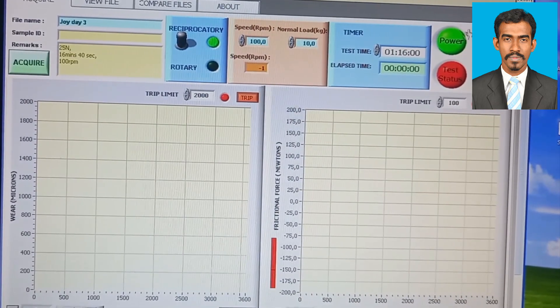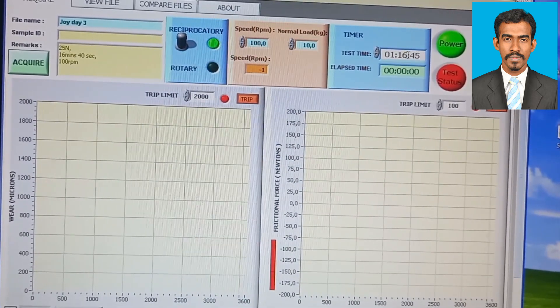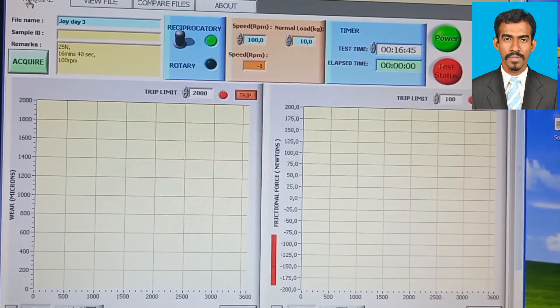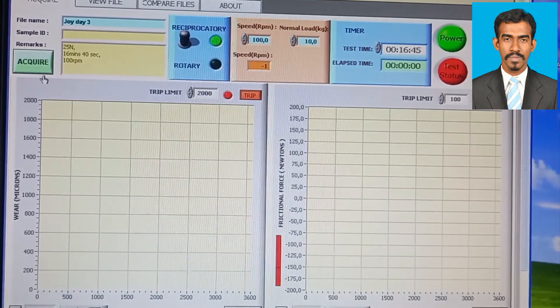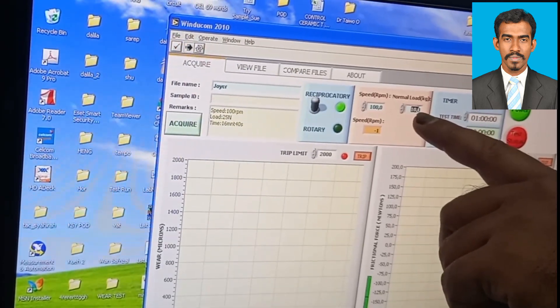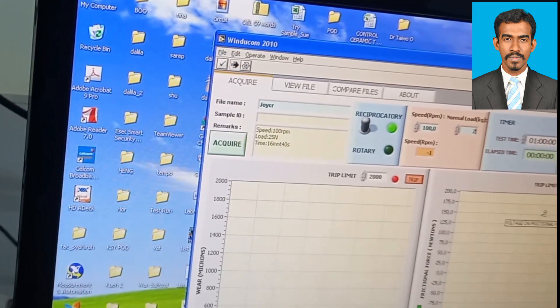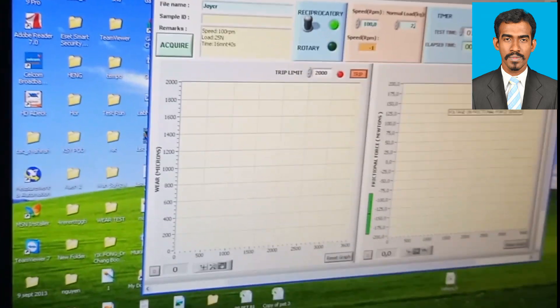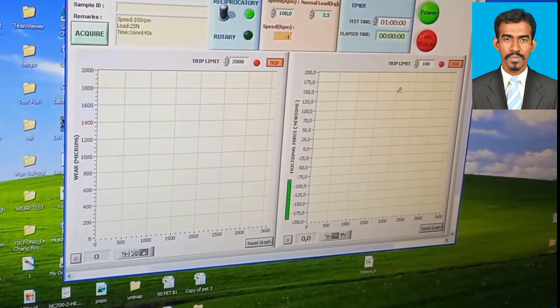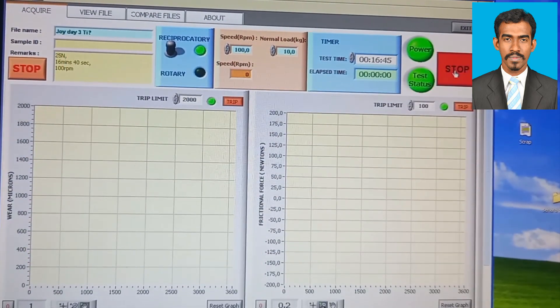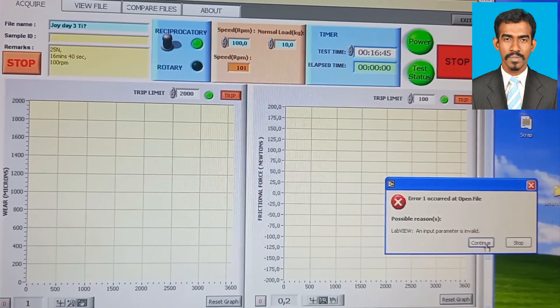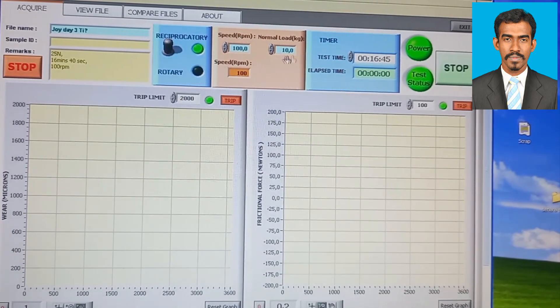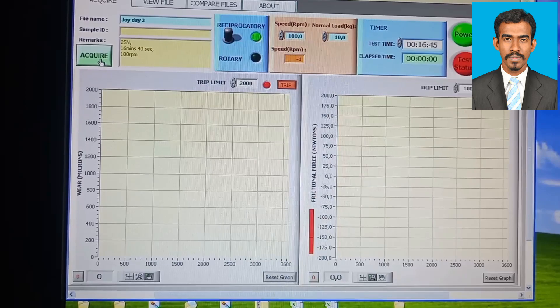Here we are going to set our time. For my run of 1000 seconds, I'll set 16 minutes and 40 seconds. Here is the setup for the force. The force which we enter should be equal to the force we applied through the loads on the machine. If they are not equal - for example, if we put a load of 2.5 kilograms on the machine and then put 10 kilograms in the software - that will show an error message like this. Once we enter all the parameters, we will set the force to zero.